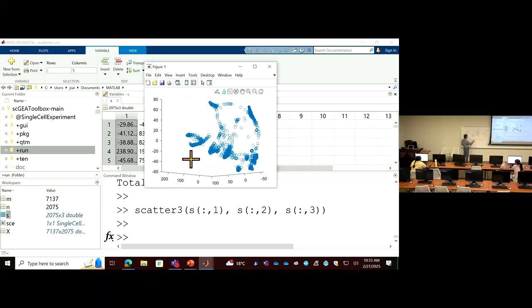The second cell is group 3. You have these numbers, and using these index numbers, you know that this cell and this cell and this one are cluster number 1, and this and this and that are cluster number 2. Those are the indices.